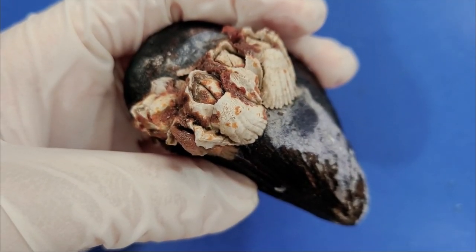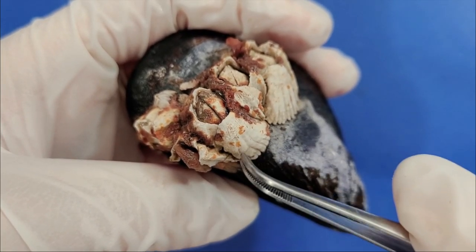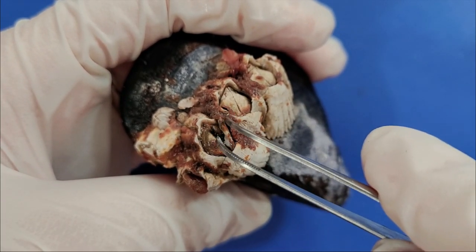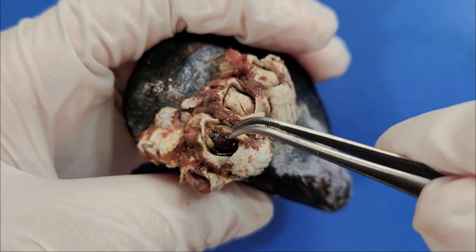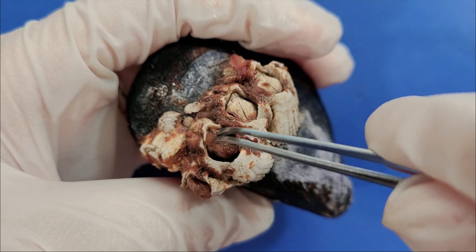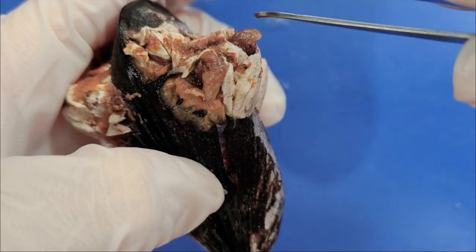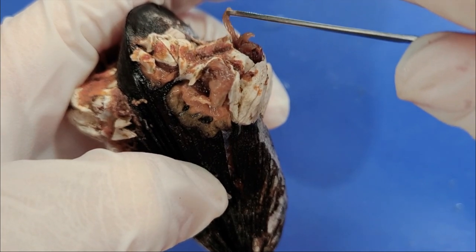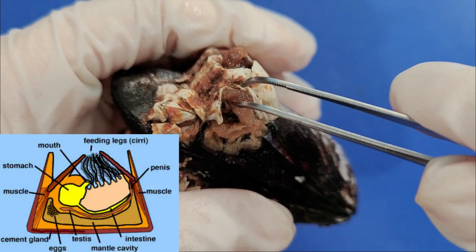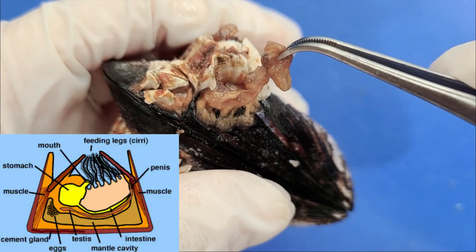Now for some bonus content, let's take a quick look at the anatomy of a barnacle. Barnacles are surrounded by a hard shell that they secrete around themselves, which also covers their mouth right here. If I remove the pieces over the mouth, you can see inside. Barnacles are suspension feeders, which means they filter out food particles in the water. These are the feeding legs, also called the cirri, which capture food particles and bring them towards the barnacle's mouth. In a cross-sectional view, you can see that the cirri here lead into the stomach here, this pouch-like structure, and then it leads down into the intestine.